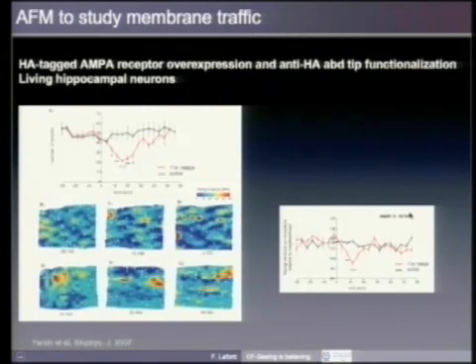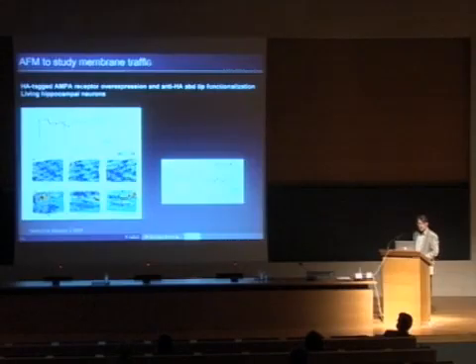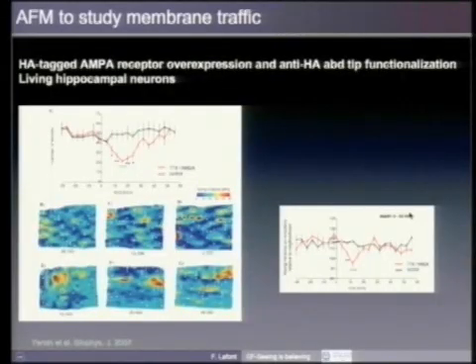And what you see is that all those receptors that were in stiff domains were internalized into the cells. And this is something that is also studied by biochemistry in neurons, that these receptors are localized in stiff domains. Actually, they are localized into rafts. So this is illustrating that using the same strategy as before, you can also follow kind of membrane trafficking at the cell surface.